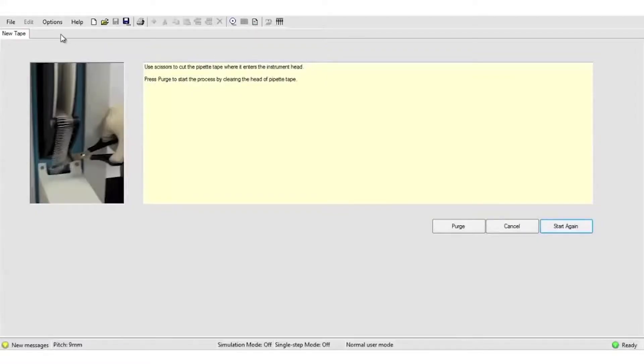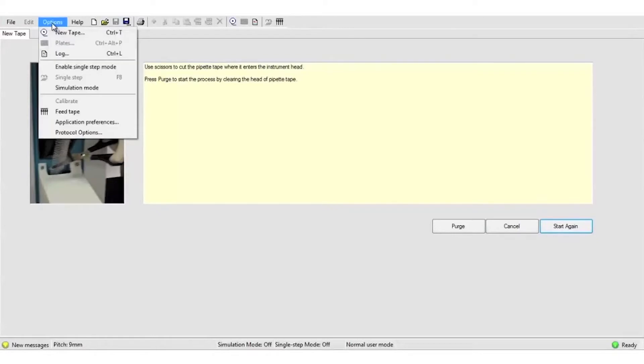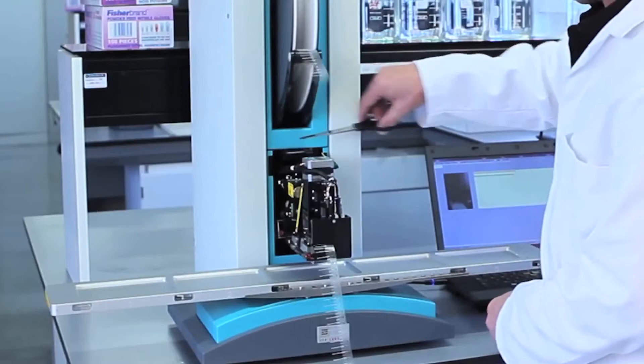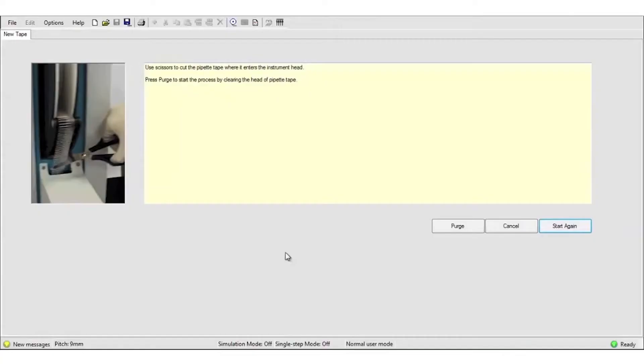Next we're going to go to the software and there's a step-by-step wizard to help you change the spool. The next step is to use the scissors to cut tape and then to press purge.